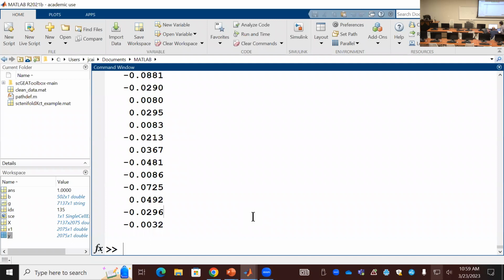You just copy this email to me. So, okay, you want to do the violin plot for different genes. Let's see.